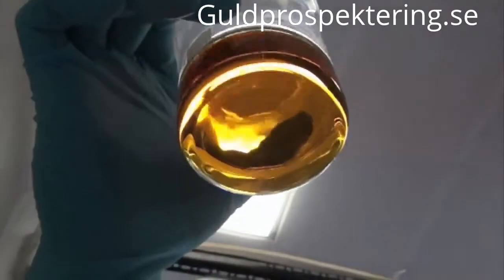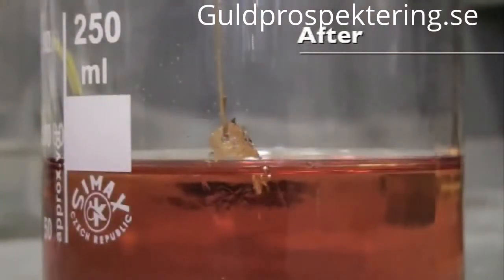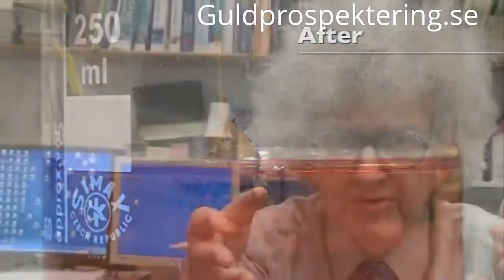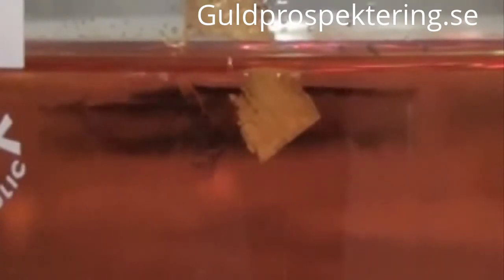This material is then quite soluble in water. So, provided you don't have too much gold, it will all dissolve. You will get a brownish or greenish solution depending on how much gold is in there. Aqua regia is quite a nasty material — you have to use it in a fume cupboard because of the fumes of NO2. Unless you want to dissolve gold, you don't usually need this. It is a pretty good cleaning material if you have glassware that you can't clean any other way — the sort of last resort.